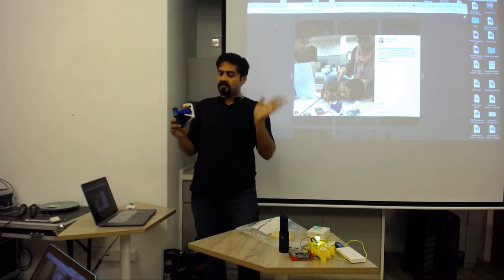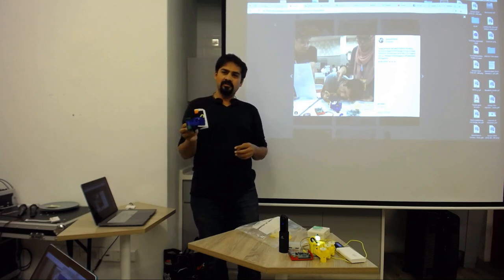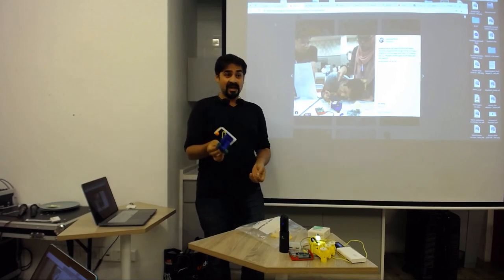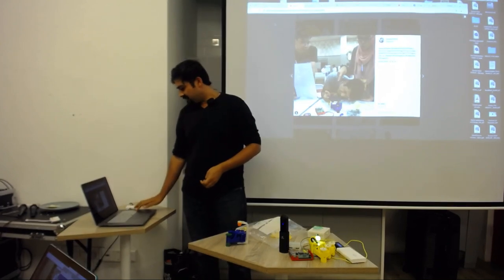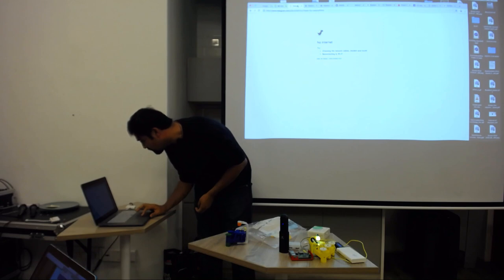Anyway, so long story short, this is a microscope, even though it doesn't look like one, and it was made on a 3D printer. And if you want me to send it to you, I just need your email address and I'll send you the file. Thingiverse, exactly. It is available on Thingiverse.